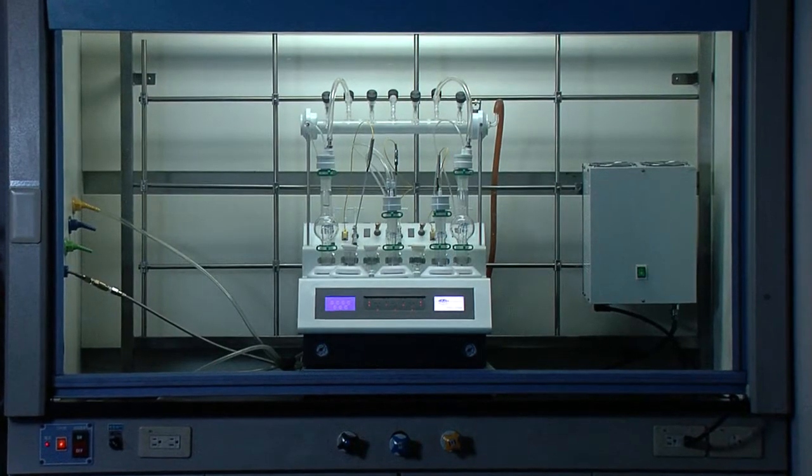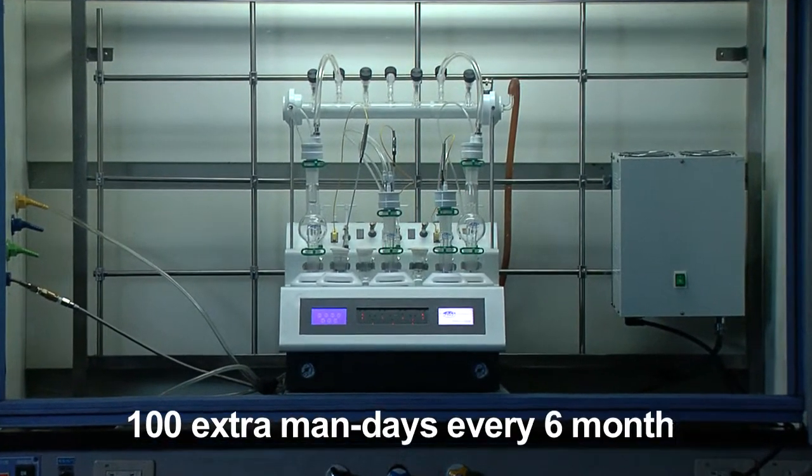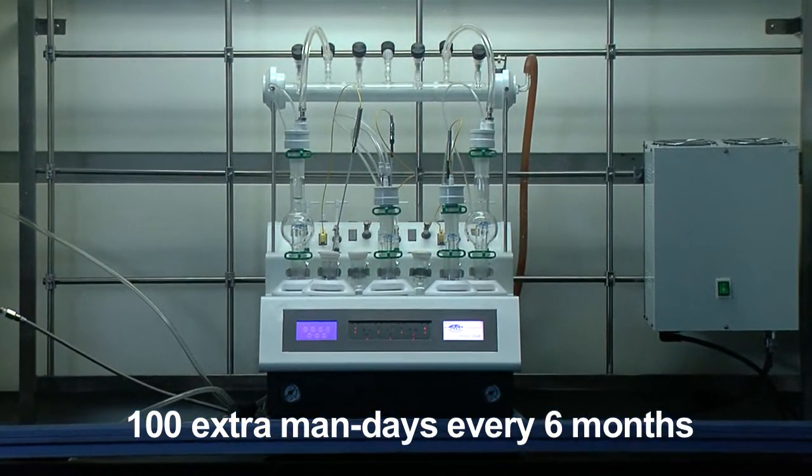By conducting reactions day and night, one Pro7 can create 100 extra man days every six months.